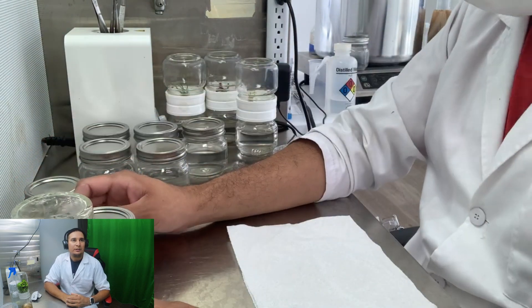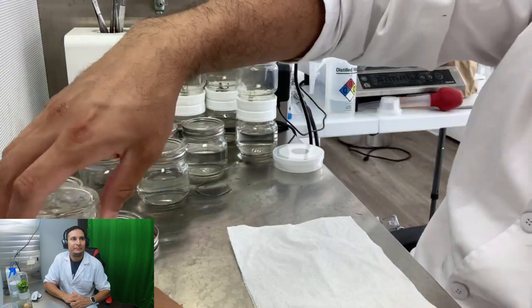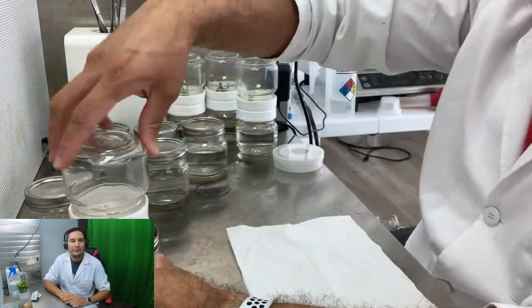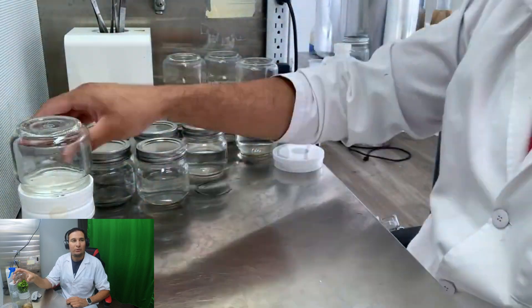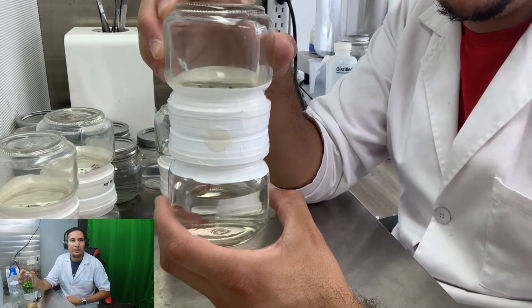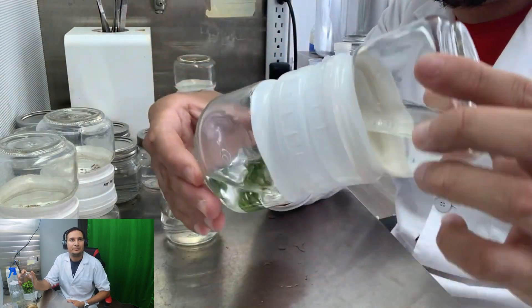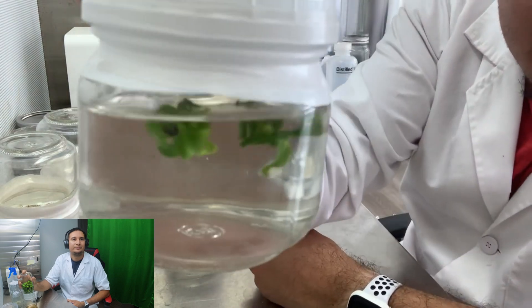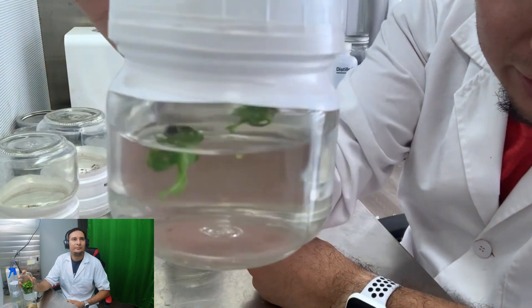You can see the plants were still very very small compared to what they are now. But basically since I moved the plants from those jars into here, they've really grown significantly.